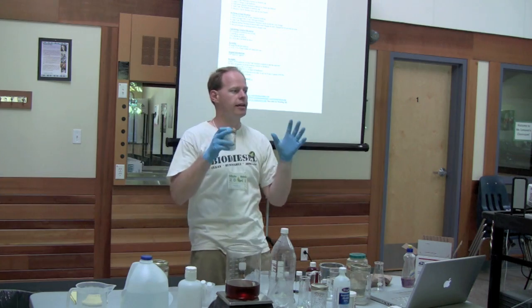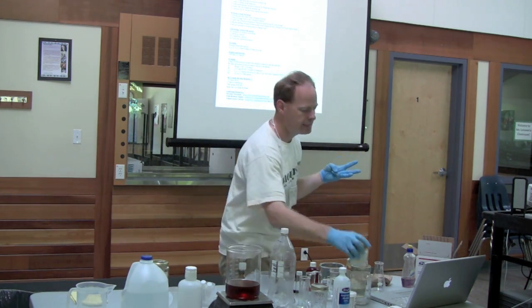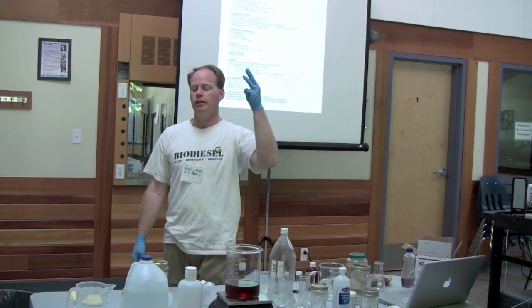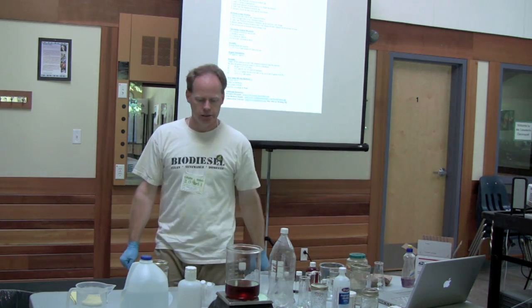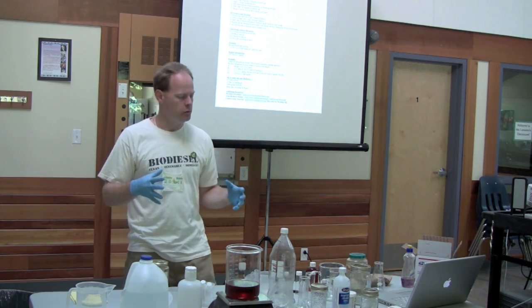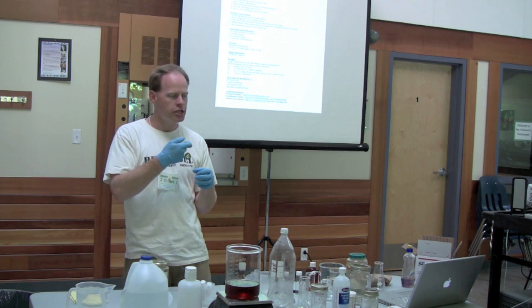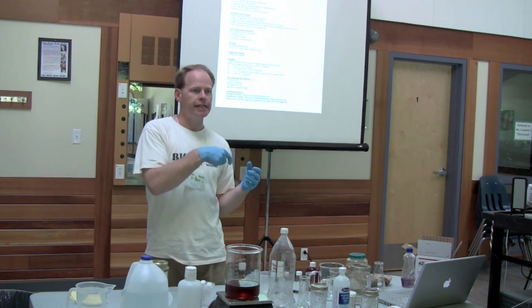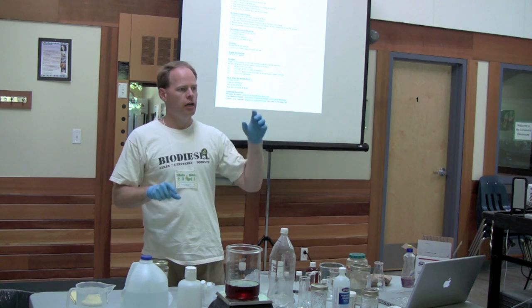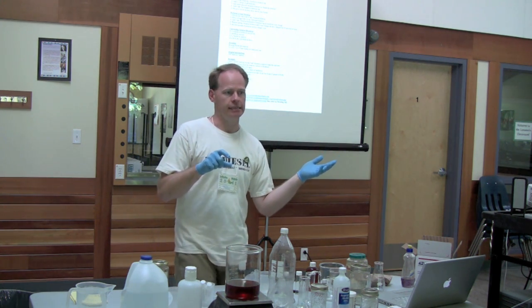I know you got to see the real deep chemical part about it earlier today, but in a really simplified version, we're just counting how many fingers are falling off in the oil, and we call those free fatty acids. So to get started, we need to make up a known basic solution that we can use to measure, to neutralize acids. And what we do is we count how much of that basic solution we've used, and we know what it relates to in acid content.